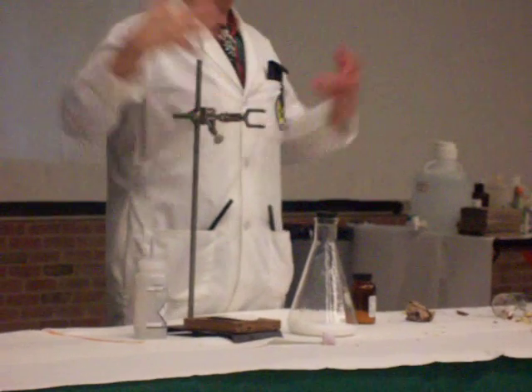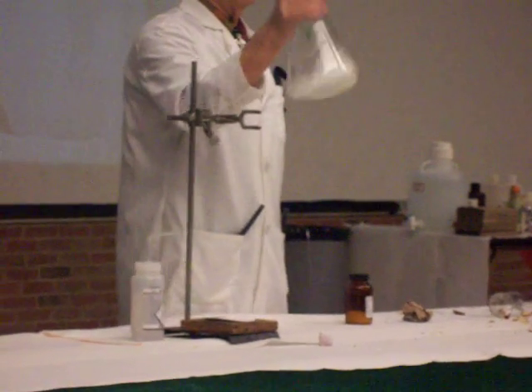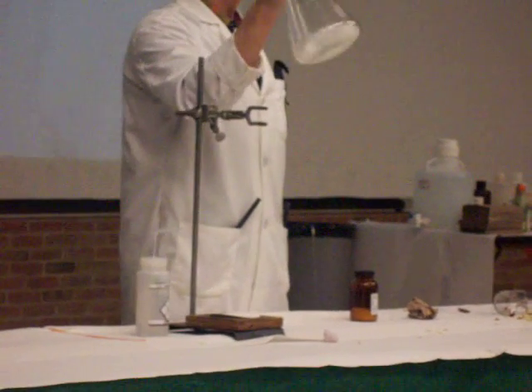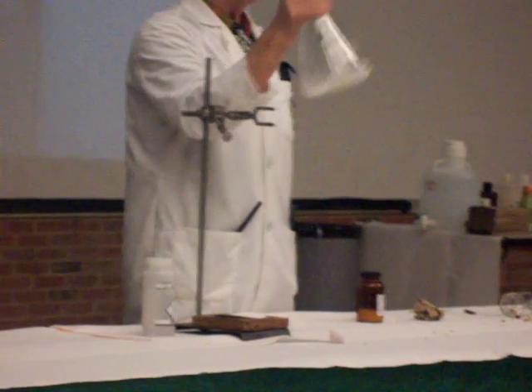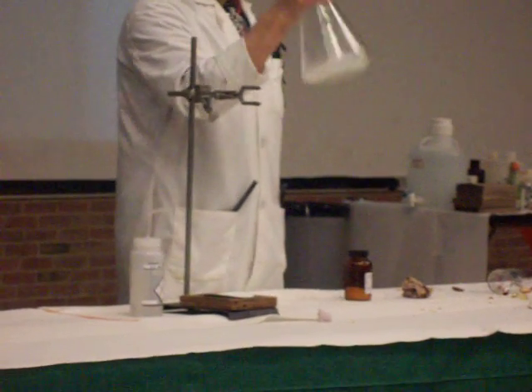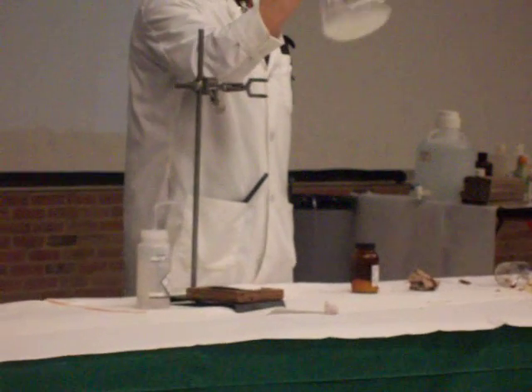Those are reactions to which heat is given off. In this clasp, I'm going to mix up those two solids. This is an example of an endothermic reaction — that is, it absorbs heat, and it absorbs so much heat that it will actually get very, very cold.